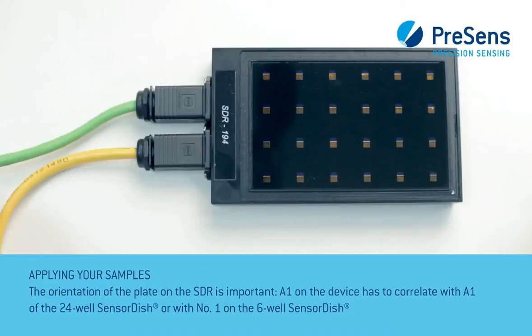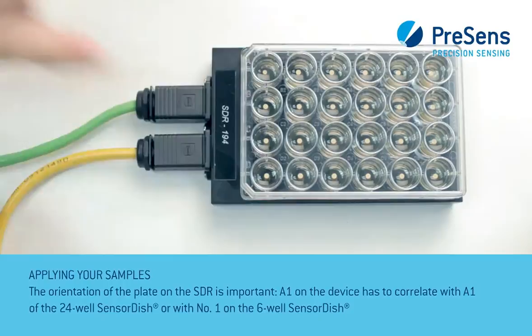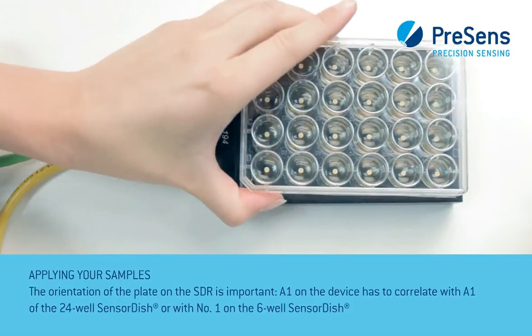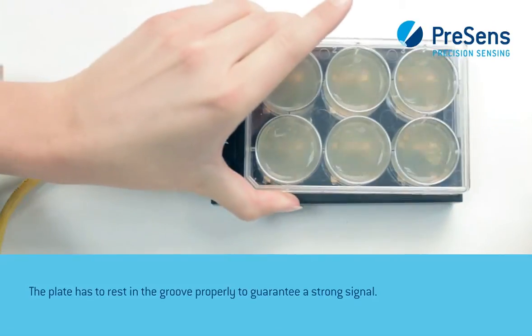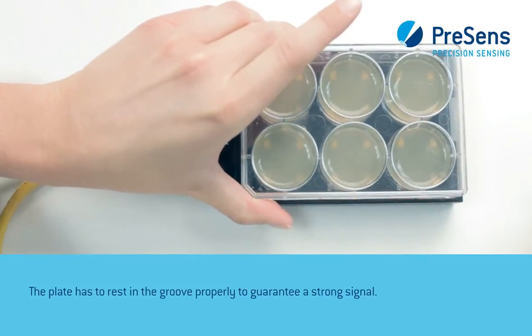The orientation of the plate on the SDR is important. A1 on the device has to correlate with A1 of the 24-well sensor dish, or with number 1 on a 6-well sensor dish. The plate has to rest in the groove properly to guarantee a strong signal.